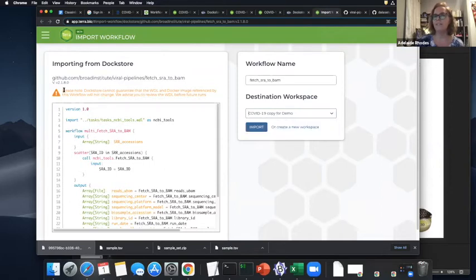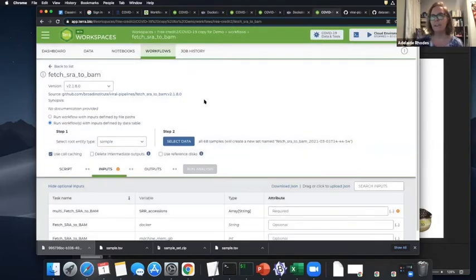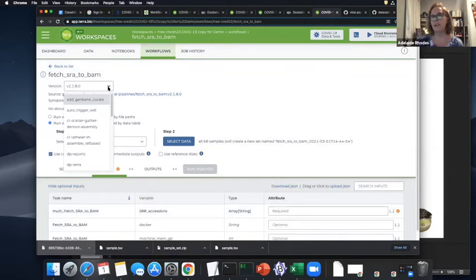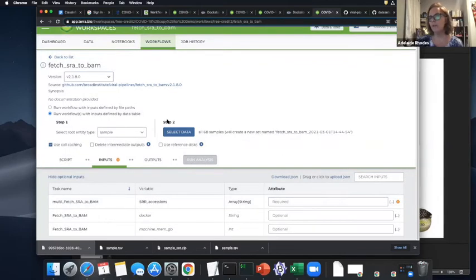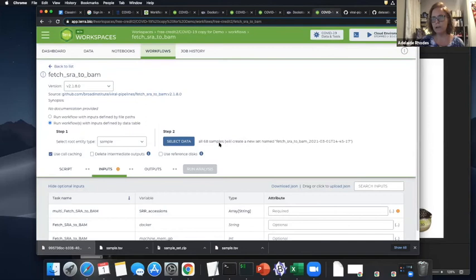And I love this disclaimer, DocStore cannot guarantee that this works. It isn't going to change, but that's fair enough. So I could do that. I already have that workflow in there, but yeah. So when you're creating a workspace, you might have just gone to the DocStore and found that and had a brand new workspace, but I'm trying to do it. So here you can see now I've got the workspace twice, but they're identical, right? So it doesn't matter which one I use except how it's tuned. So how is it tuned, right?